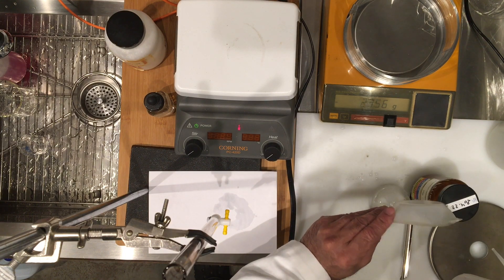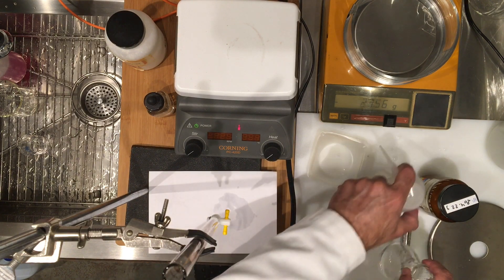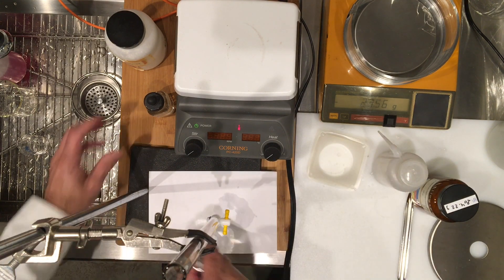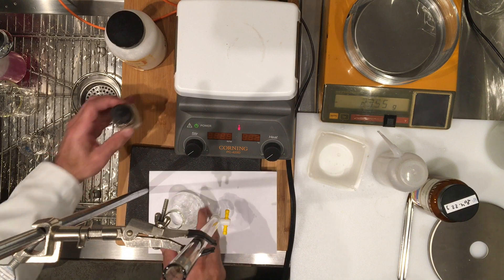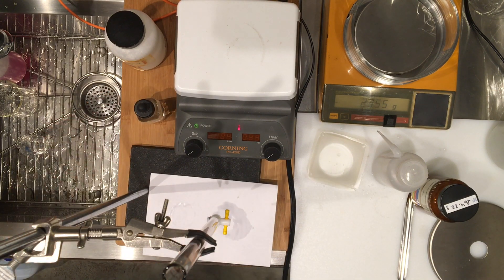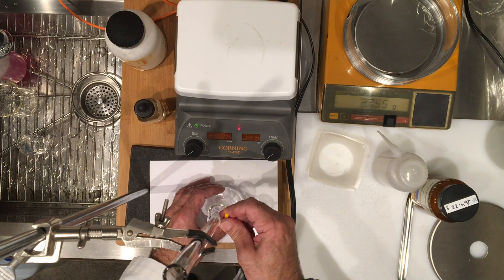There it is — I have quantitatively transferred 0.430 grams into my flask. Let's not forget our indicator. And because this is slightly higher than the last titration, I can go ahead and safely add the previous volume of the titration, so I think it was roughly around 20 to 21 mL, so I can go ahead and pour that in.